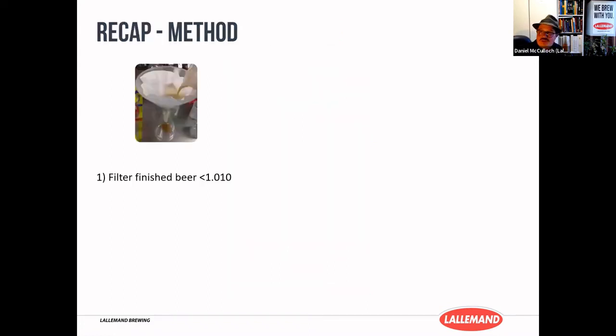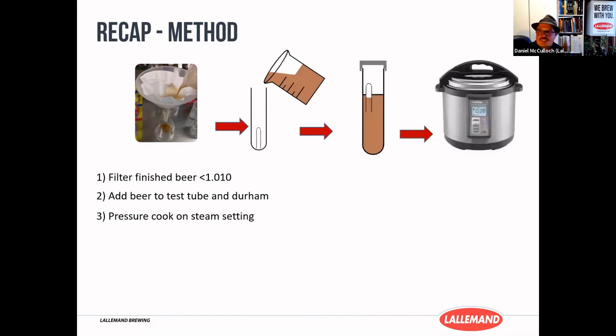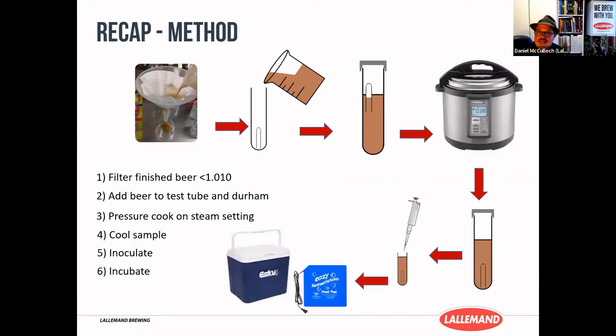Just to recap on this really simple method: filtered beer that is finished fermenting, around 1010. So we know most of those maltotriose and maltotetraose sugars have been consumed. We pour that in, the tube will float. Once we put it into the pressure cooker on the steam setting for about 21 minutes, that will sink and also autoclave the beer so that there's nothing else in there, just the beer. Ready for the test, we inoculate, and then you want to incubate to make that reaction faster of what's happening.